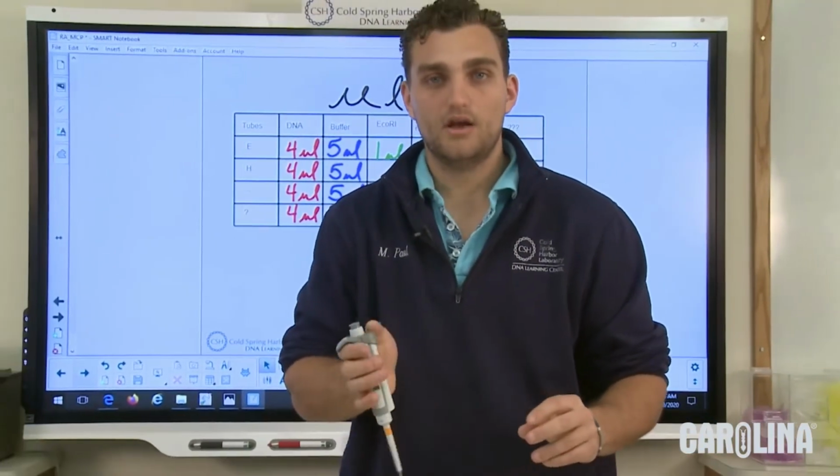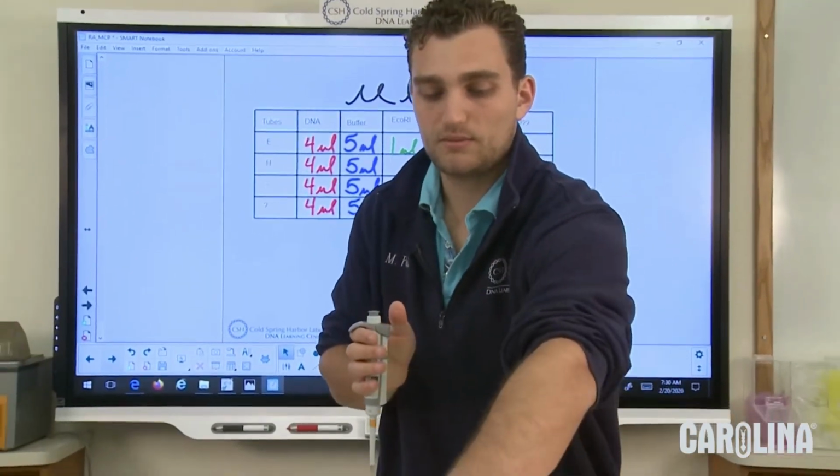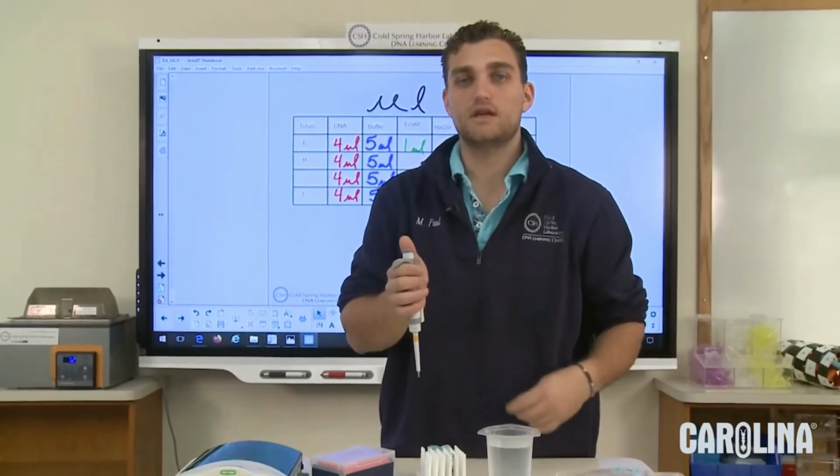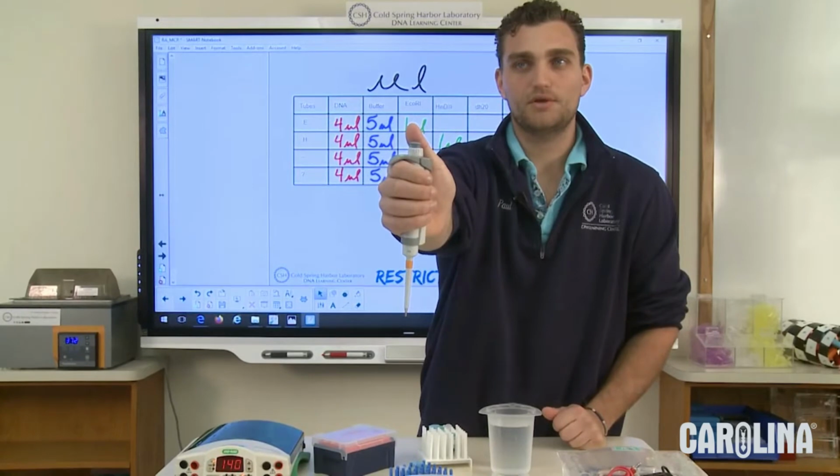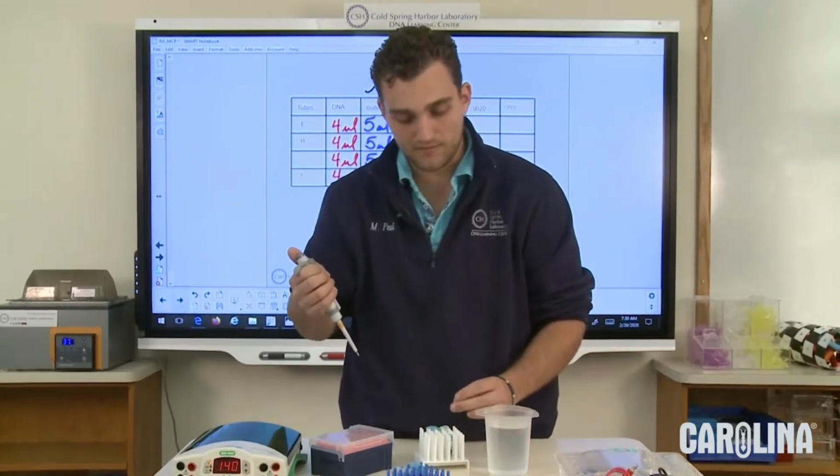To pipette, you'll notice that the difference between my finger being completely released and pushing down to that first stop is really, really small. The difference between being completely released and the first stop is really small. So we have to be very careful.